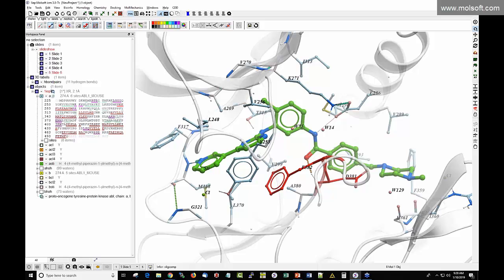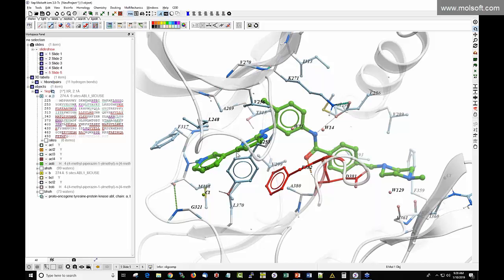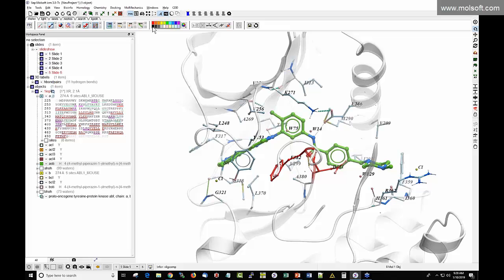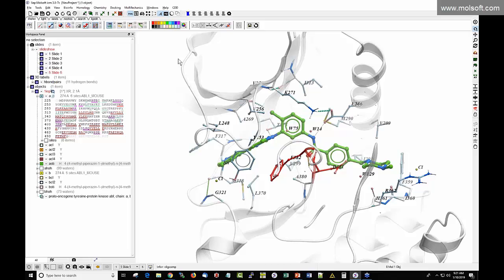To change the background color of your image, right-click on the color panel — that changes the background color. We now want to compare the DFG-out structure (1IEP) with a DFG-in structure. To do that, go to the search tab and load PDB code 1OPK, which is the same Abl1 kinase in a different conformation.